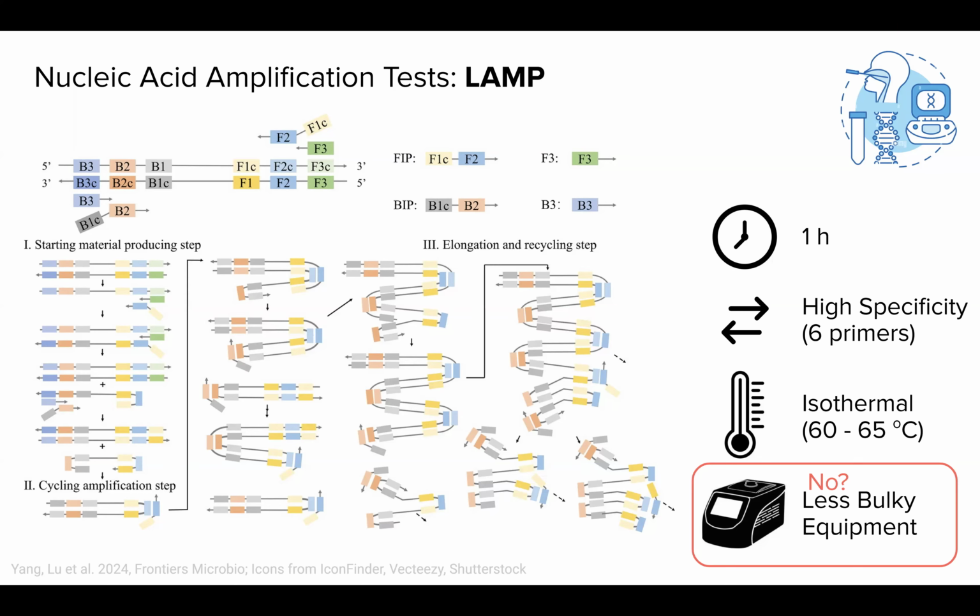Yeah. And so the DNA polymerase that we're using operates at about 63 degrees Celsius. If you go any higher, the protein has the chance of denaturing and becoming inactive. If you go any lower, then the reaction may not happen at all, or it may just be super, super slow. So there is a sweet spot that you can do some testing around. And then we're actually trying to engineer a new DNA polymerase that's able to operate at higher temperatures, because then you have faster kinetics.